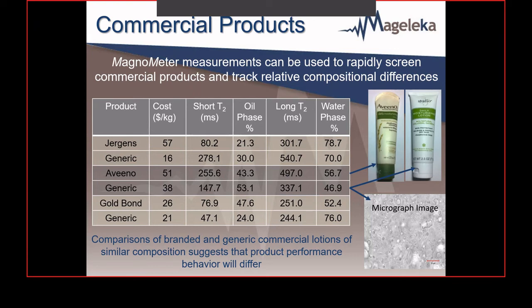And the NMR relaxation value you get is the specific fingerprint for that particular emulsion itself. Being multi-component, it means you really can't dilute these materials without consequence, because the dilution process destroys any structural characteristics and can also induce instability, leading, for example, to creaming and often breaking itself.